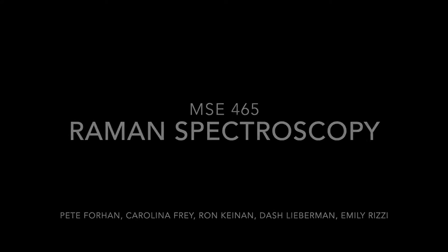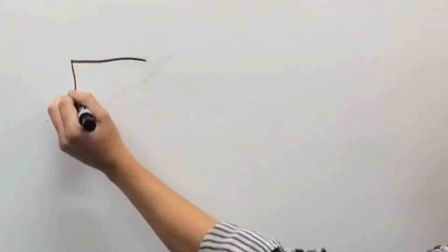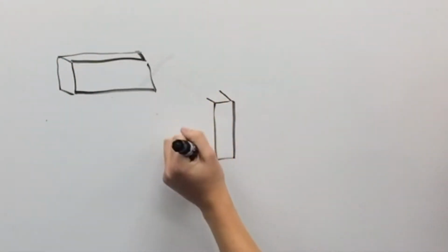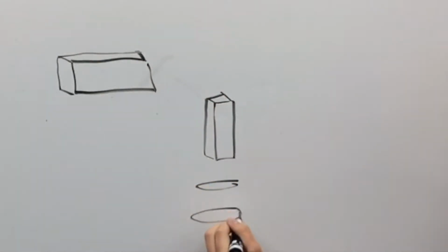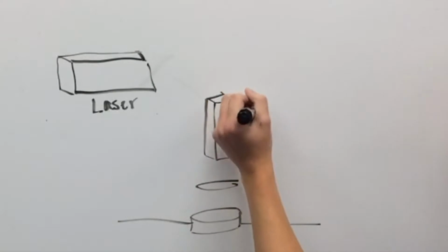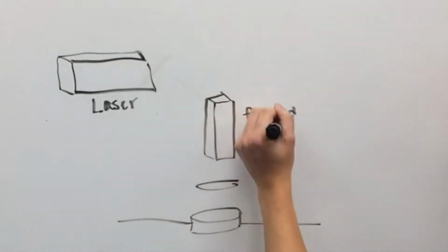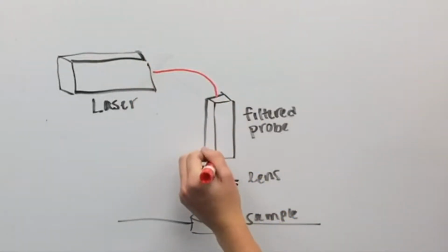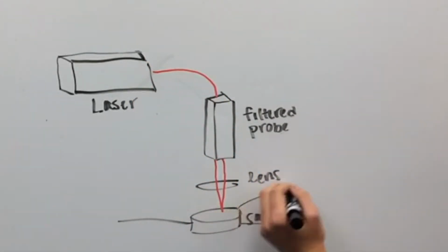Raman is a vibrational spectroscopy which is capable of providing chemical and component information with high spatial resolution. The source is a beam of photons with wavelengths in the visible spectra from a pulsed laser. There are then lenses to focus light onto the sample and to collect the scattered light, and filters to purify the reflected light and scattered light so that only Raman light is collected.